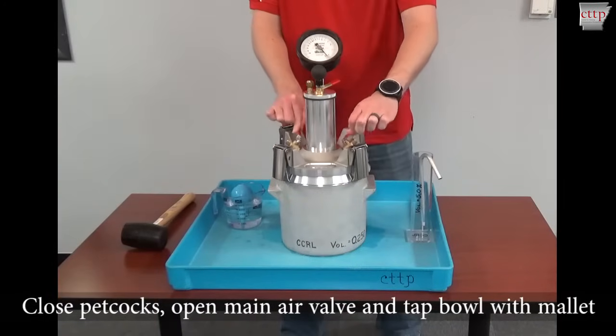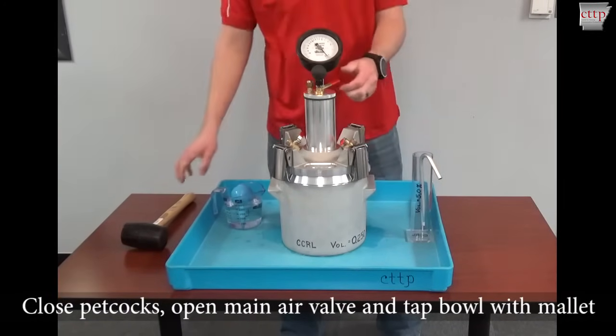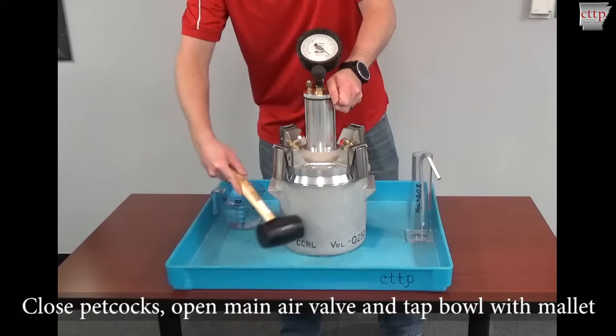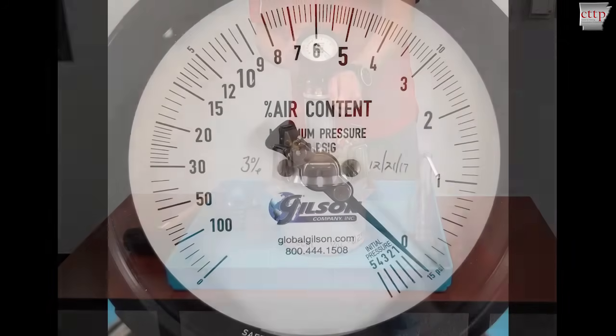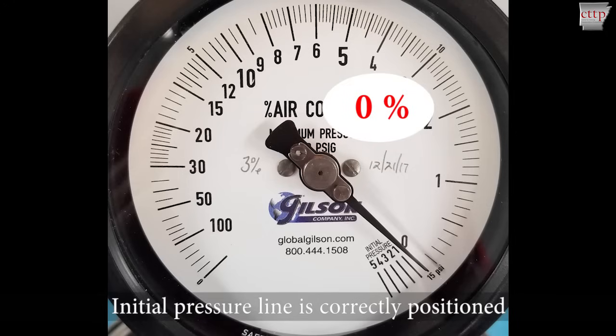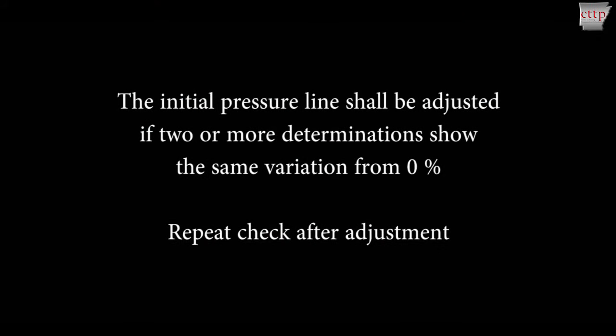Close both petcocks. Open and hold the main air valve and tap the sides of the bowl with a mallet to release trapped air. Tap the dial gauge with your fingers to stabilize, still holding the main air valve open. If the initial pressure line is correctly positioned, the dial gauge needle should read 0.0%. The initial pressure line shall be adjusted if two or more determinations show the same variation from 0%. Repeat the check after adjusting the setting for the initial pressure line.